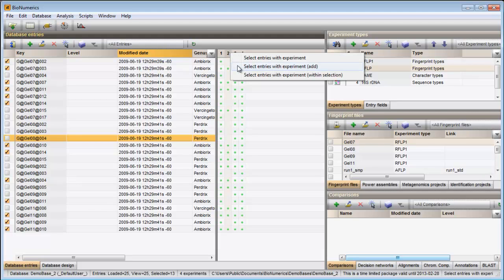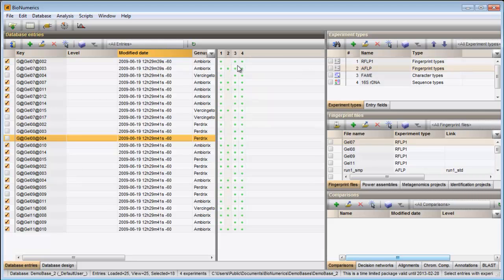As an example, I will choose the second option. All entries that have an experiment for the AFLP experiment type are added to the current selection.